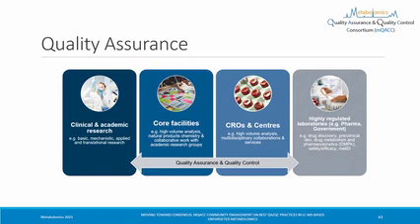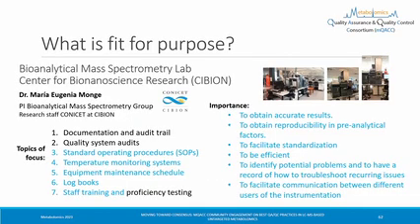In research, the decision-making is, let's plan another experiment, whereas in a clinical laboratory, it might be, let's treat a patient a certain way. So there are different thresholds of accountability across this landscape.